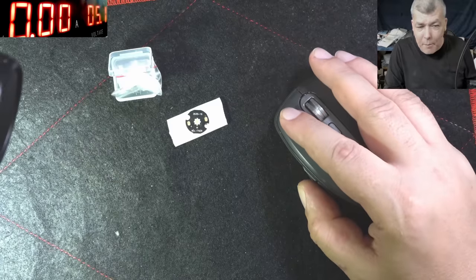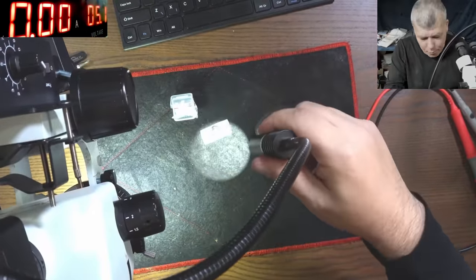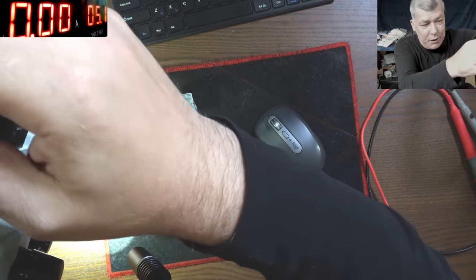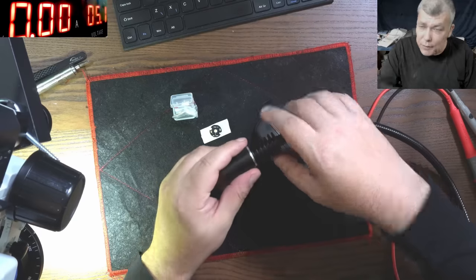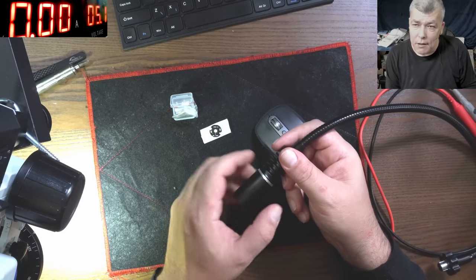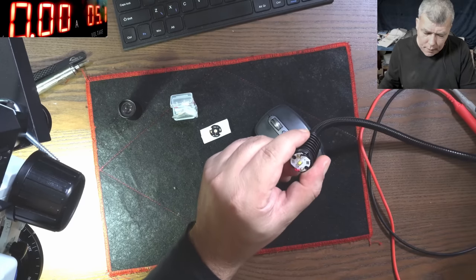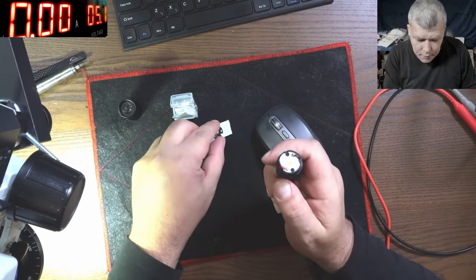What I want to do is swap my microscope lights. The current ones are about three watts each — they're okay. Let me take one out and try to swap the LED with this one. I know what you're thinking: yes, you can have more light, but what about the heat? You're right. This is a metal heatsink — I can't get rid of the heat entirely, but I can have extra power when I need it and switch the brightness up for short periods.